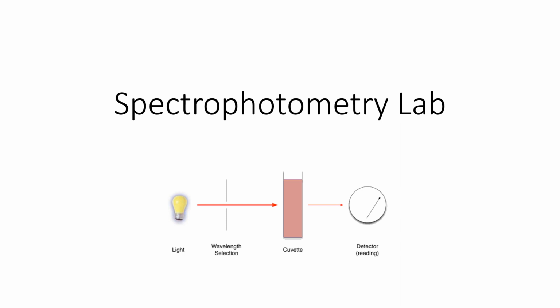Welcome. In this lab, we're going to talk through the spectrophotometry lab that we did and hopefully help you interpret your data and understand what is going on with this lab technique. So I'll be able to understand what spectrophotometry is and how we use it to figure out the concentration of an unknown.